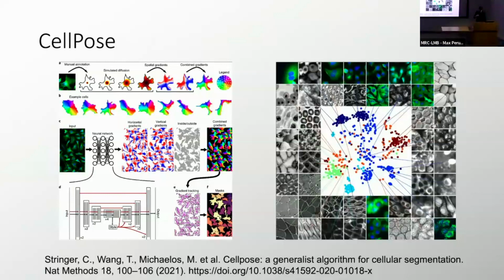The 3D is done by stitching the result applied for each plane in different directions. So it's not really 3D. It's not a 3D U-Net, but a 2D U-Net applied in each direction with some stitching steps behind. This is what is pre-trained. You can also find on the web some 3D Cellpose versions, but they are not trained on as many images or pre-trained. They are not as integrated.